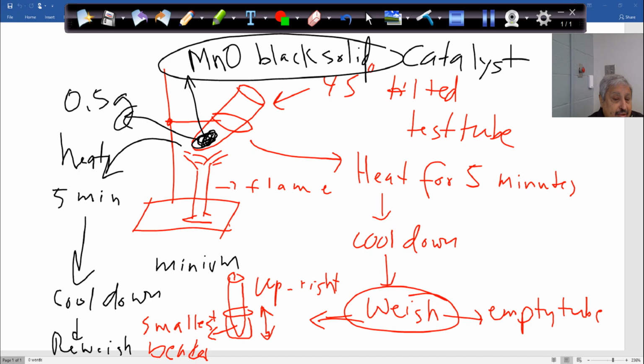Make sure that's minimum 5 minutes. So 5 to 7 minutes, it's cool. You can always touch it with tissues, not with your fingers. Okay, guys, so 5 minutes, and then it's cooled down. Now you take it out with your hand. Now you'll add to it.